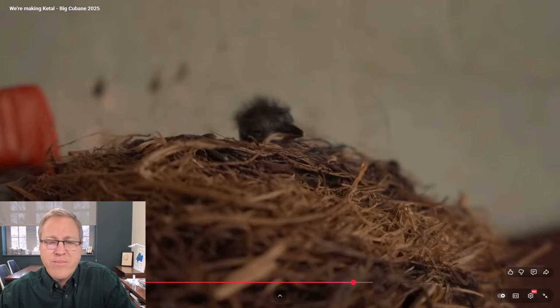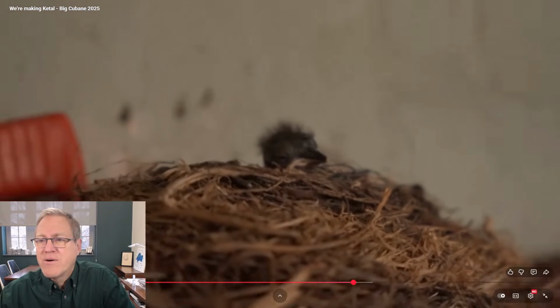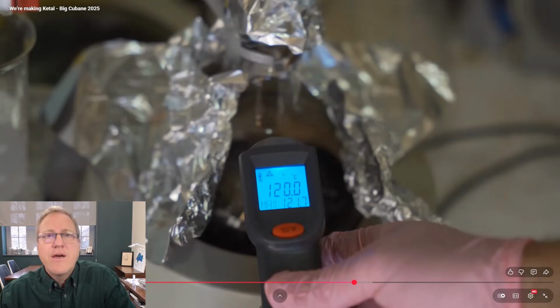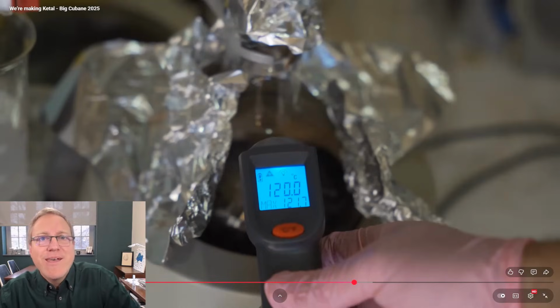Oh, and I think we can play audio here? Let's find out. Tough being a little bit, isn't it? Just a bit. There's a birdie. When I was in lab, we used to have animals, but they were always cockroaches. So it's pretty cool. He actually has birds where he's doing his chemistry.